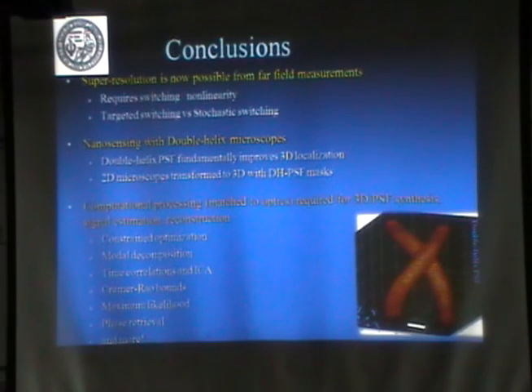If you have one spot, you cannot do it, that's a regular PSF. The next thing is you have two, right? You could have three, but then you have to spread more than this. Having said that, we have designed a PSF that has only one helix instead of two. So you can think of it as only one of these two. And that could work as well in some situations, if you have some prior information. So it depends on the problem, you can find the helical PSFs. So that's a good question.